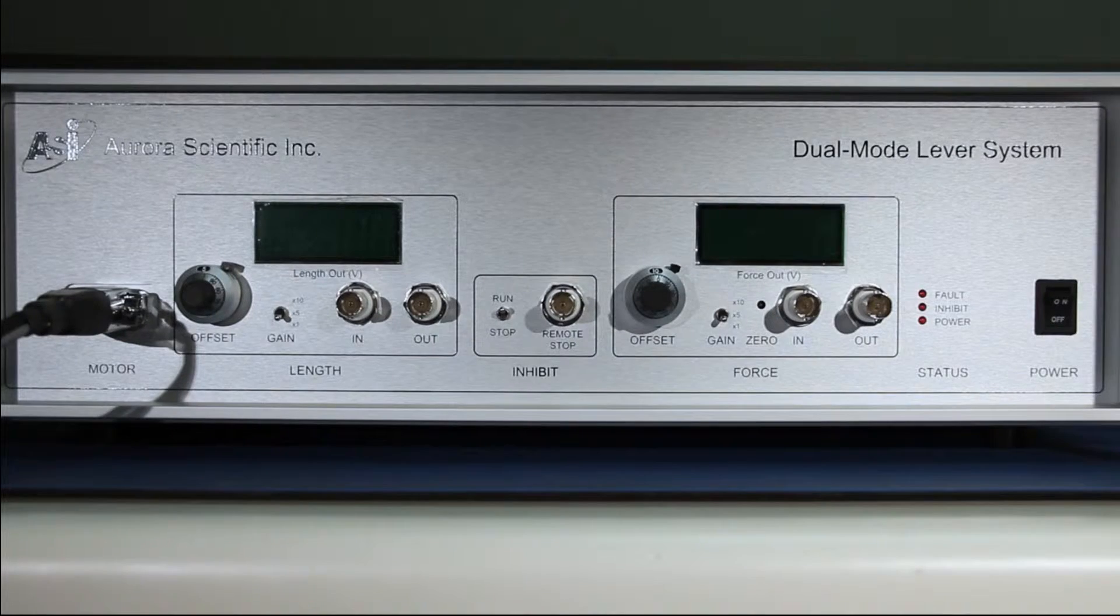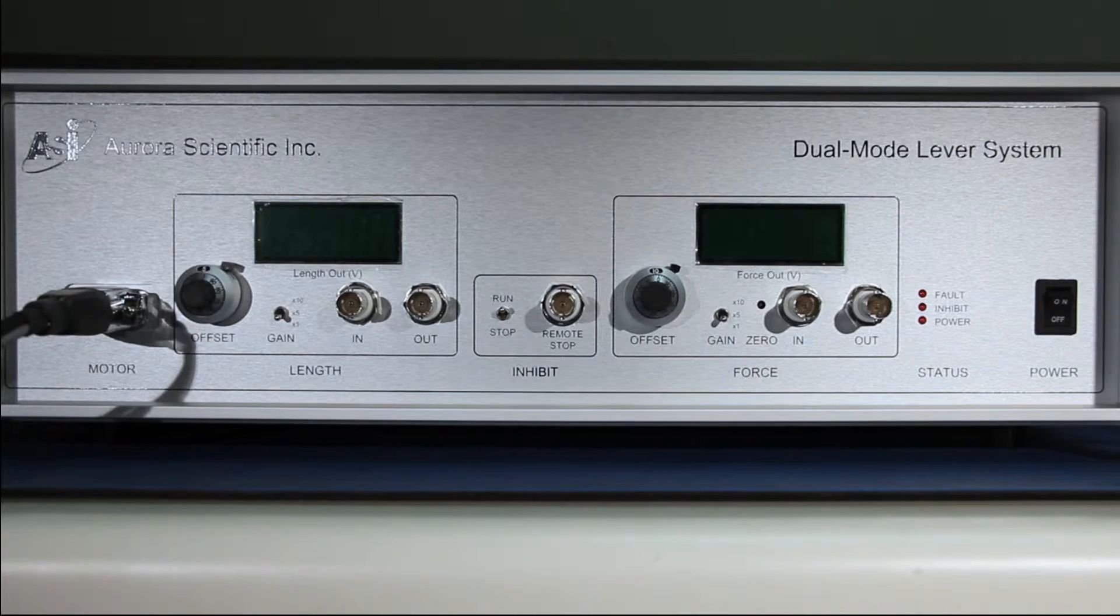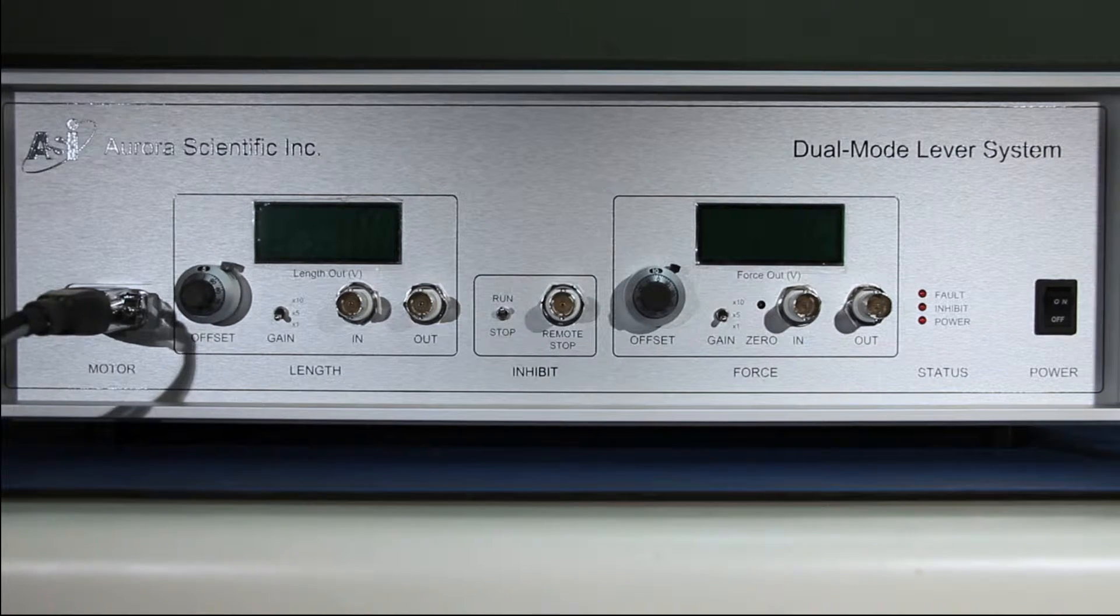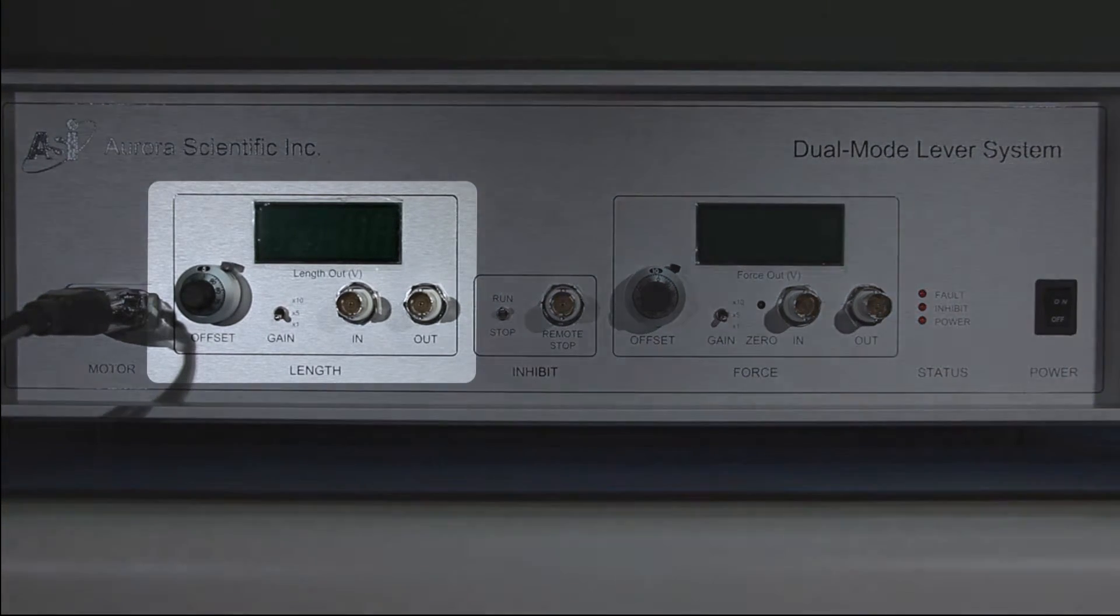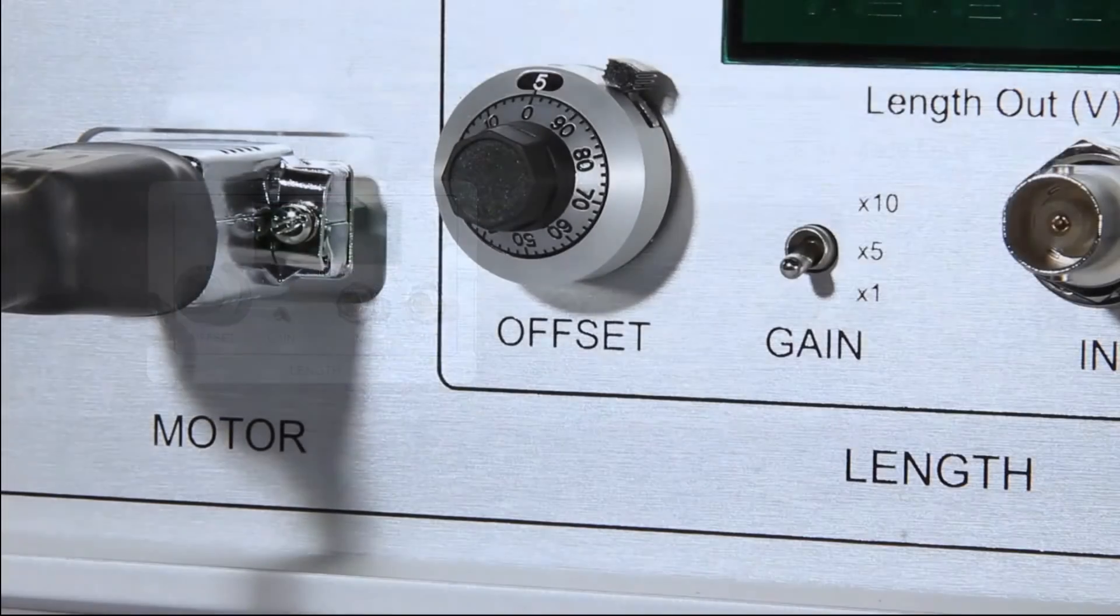Before turning the instrument on, let's verify some front panel settings. First, the length offset should be set to 5.